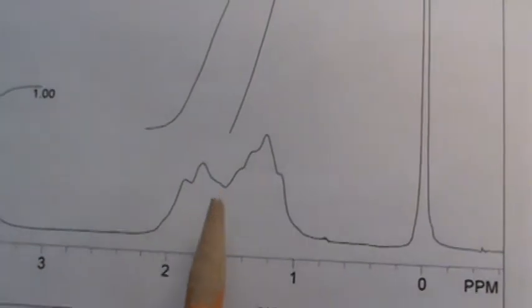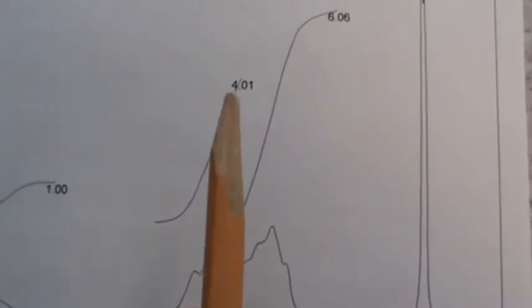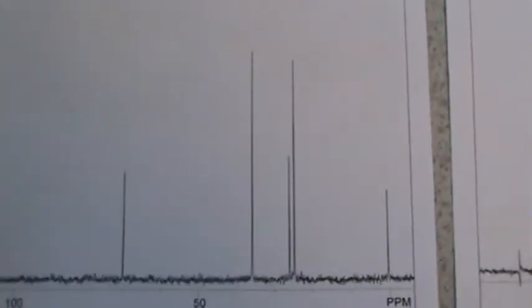And then when you look here, you could arguably say, see the 2 hydrogens here and 2 here? So that's 4. The remaining 6 will be in the other peak. So that's why this lump, which is arguably worth 4, belongs to these 2 positions, and then this lump will integrate to be roughly 6. So that's out of the bottle cyclohexanol.